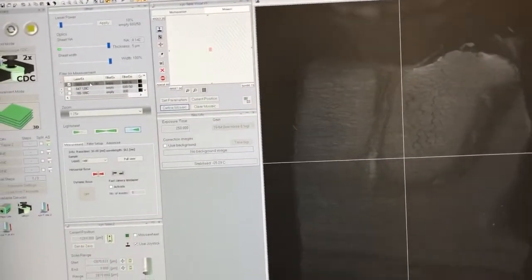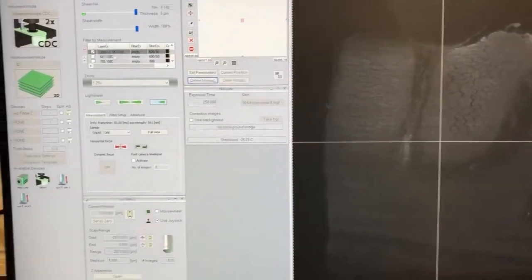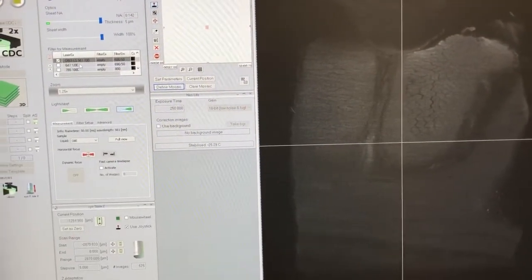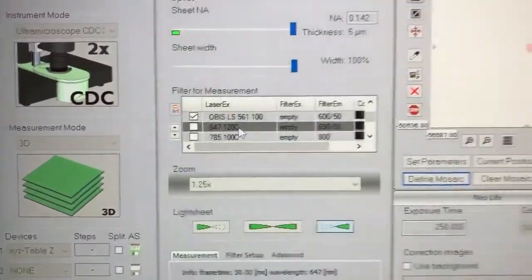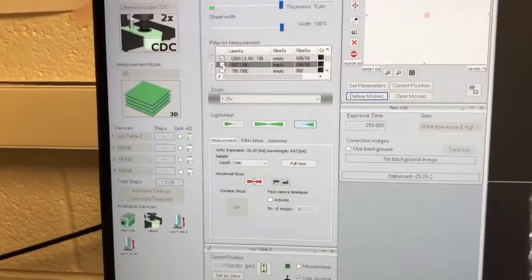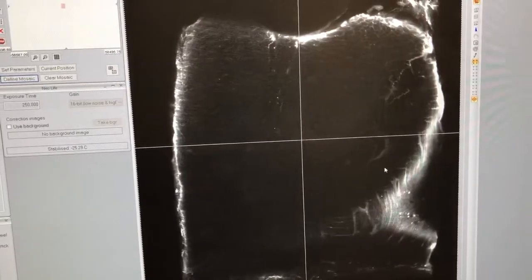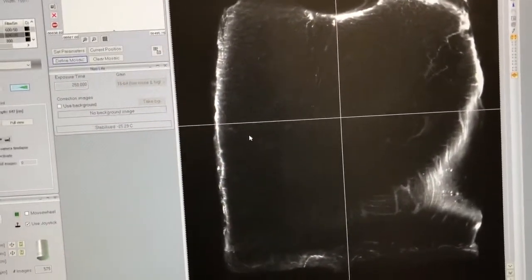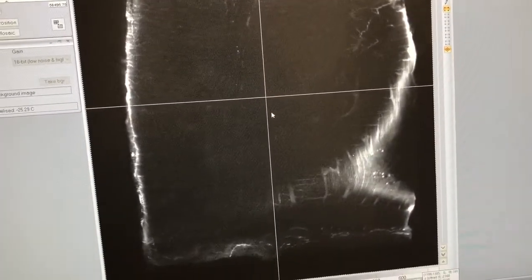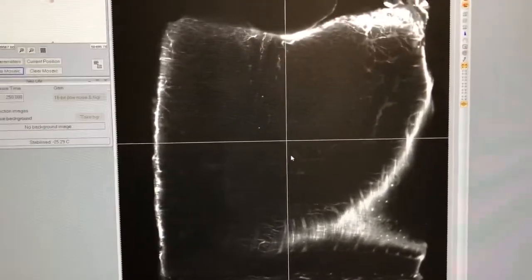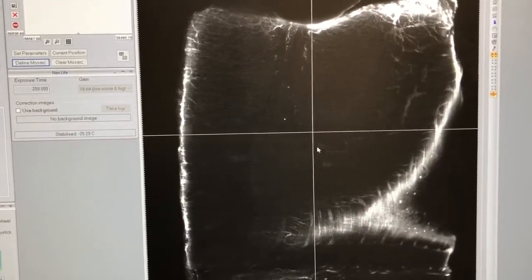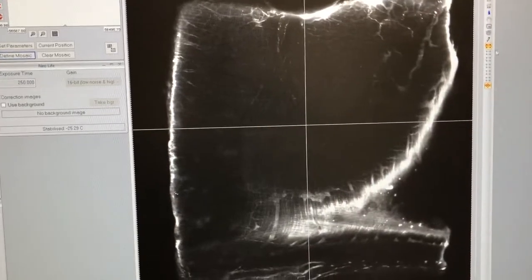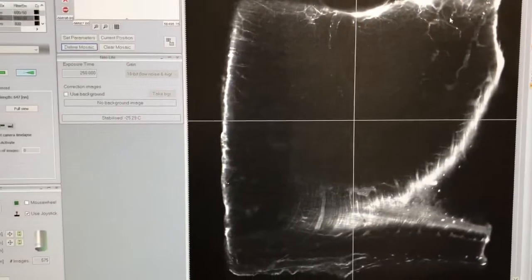I'm going to switch channels from 561, where the labeling isn't very good, to 647, which has more structure to look at. Now you can see that looks different — the checkmarks don't matter unless you're imaging more than one channel, which for the moment we're not. You can see some filamentous structures, and there's also a lot of staining on the edges. That's a typical issue in iDISCO+ staining when your antibody concentration is a little high. This is also an old sample that may have had some oxidation. But you can still see a lot of structure as I move in the z-dimension.